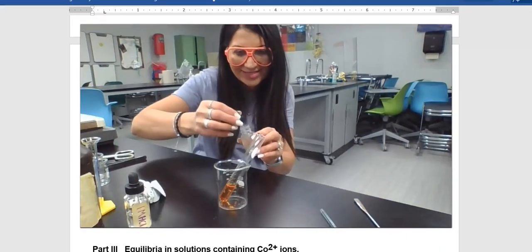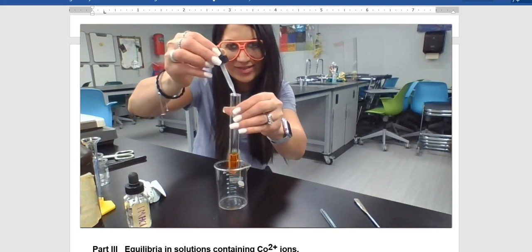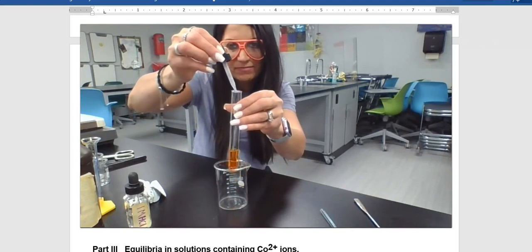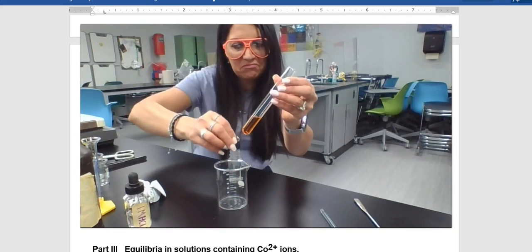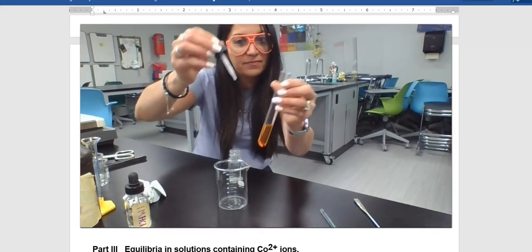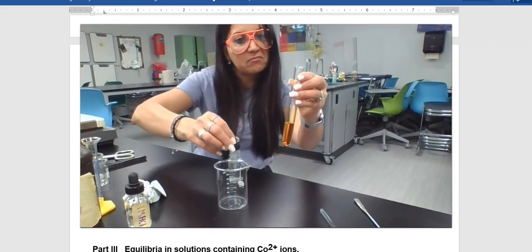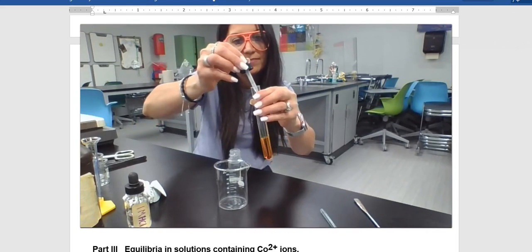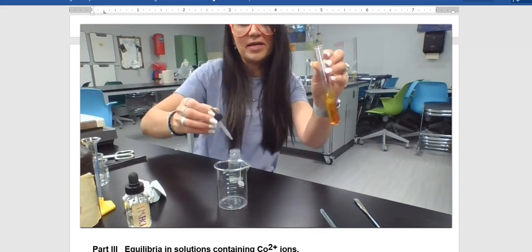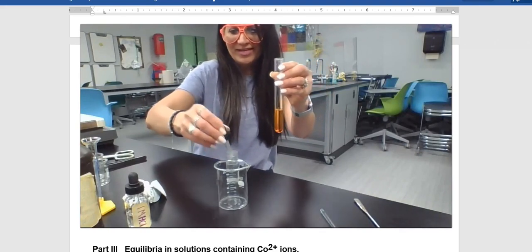Let's start adding some of the NaOH to this. I don't see anything happening. Is anything going to happen? I don't know if anything's happening right now. Oh, maybe. Are we sensing a little bit of a lighter color here?